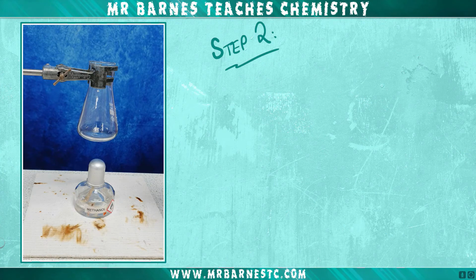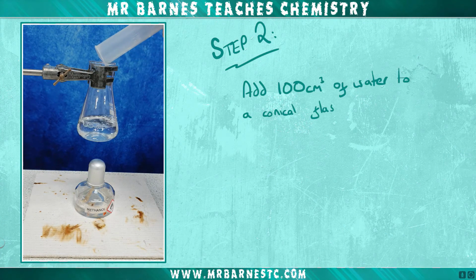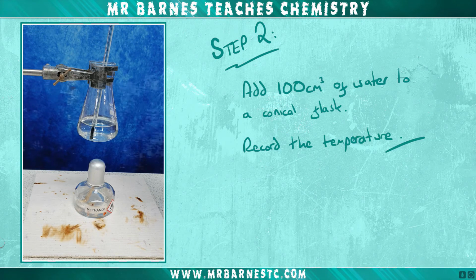Step 2, measure out 100 centimeters cubed of water using a measuring cylinder and add it to your conical flask. Once you've done this, record the temperature using a thermometer.